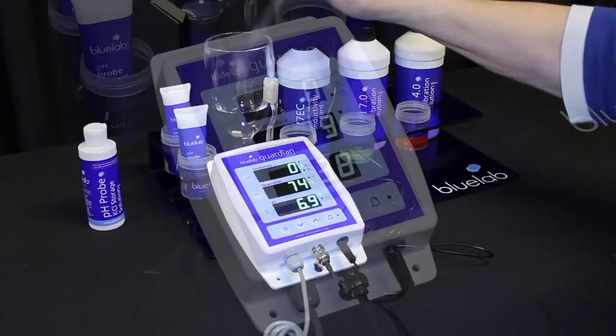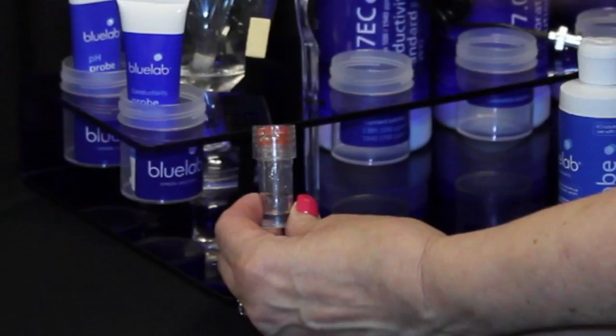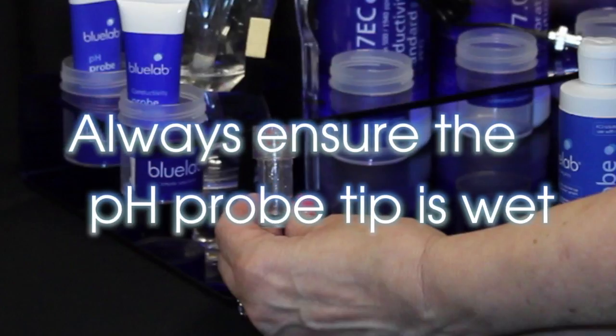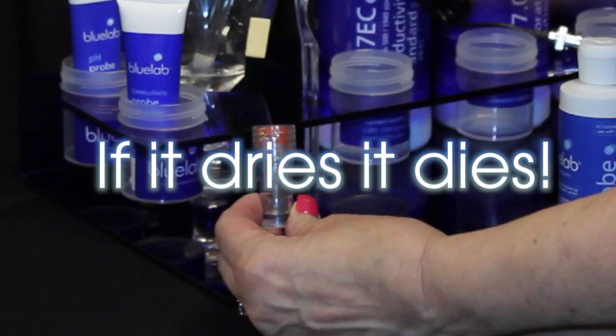Rinse the probe in clean tap water. You have successfully calibrated when you see both calibration indicator lights glowing. Store the pH probe when not in use. Always ensure the pH probe tip is wet — if it dries, it dies.